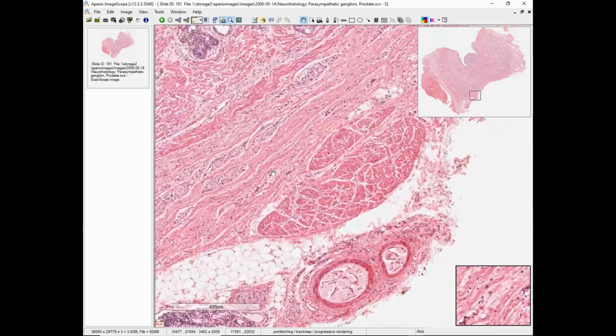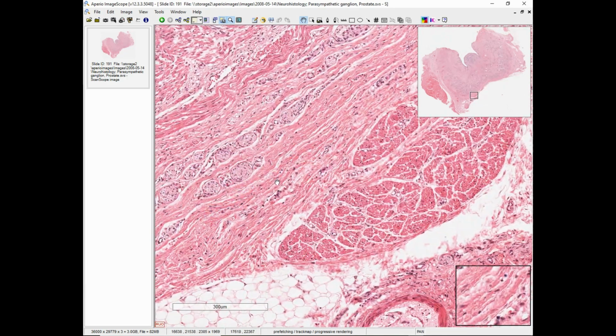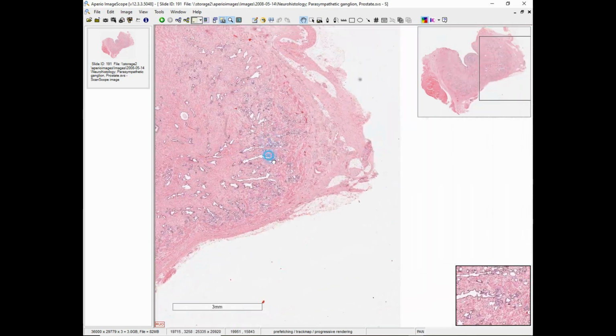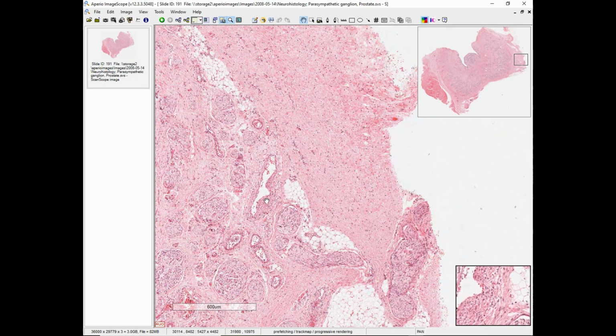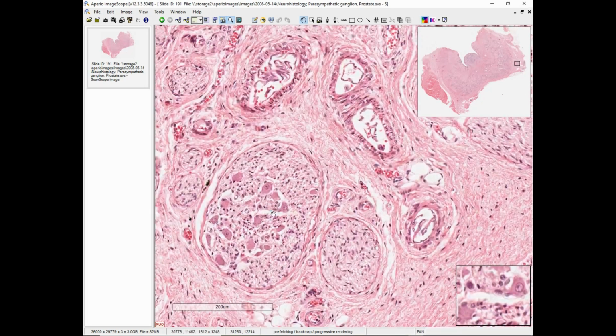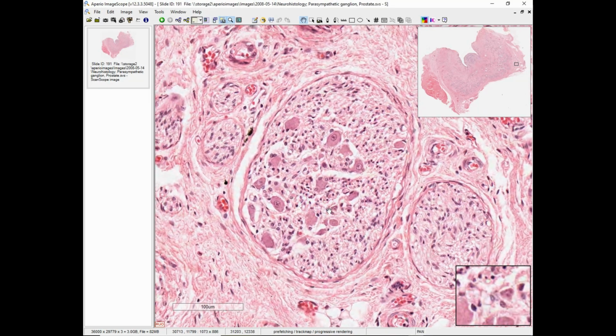I'm just going to see real quick if I can spot some other examples of those ganglia, and then we can revisit that. And here we go. You can see, just like in the posterior root ganglia, we've got these big soma here, these big nerve cell bodies, and we've got a nice looking nucleus and nucleolus there.